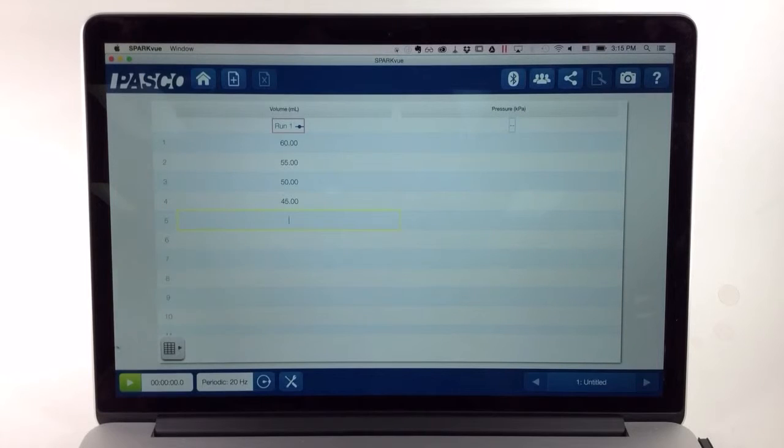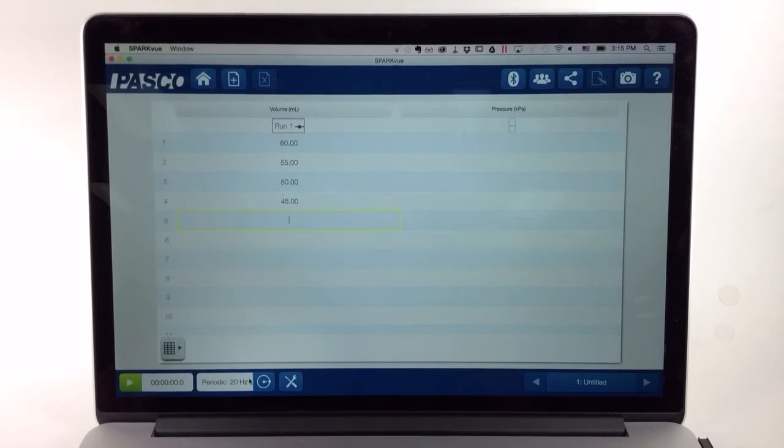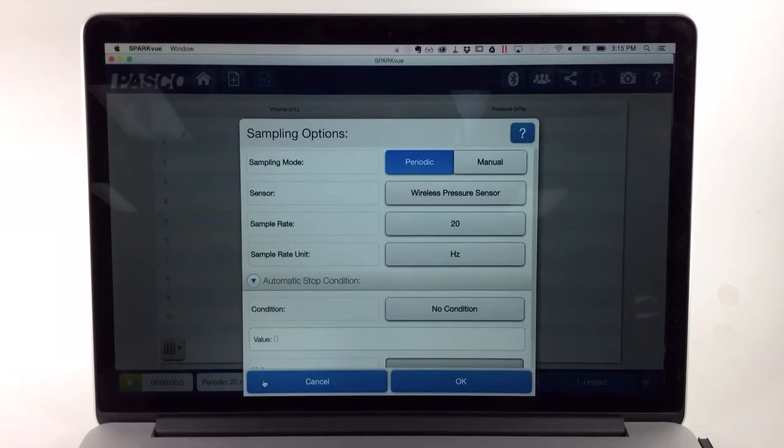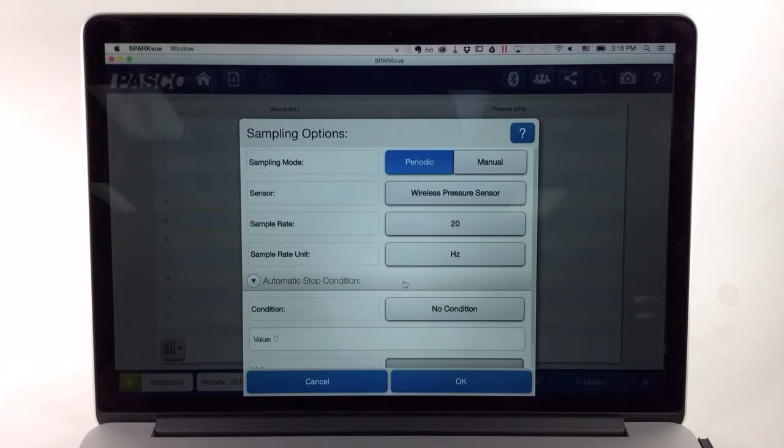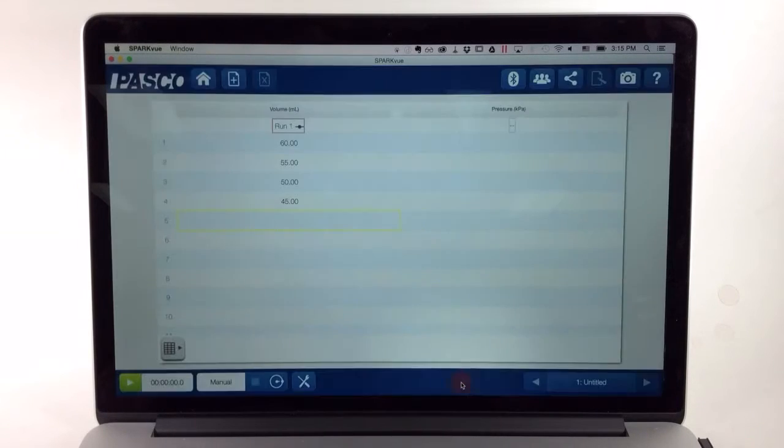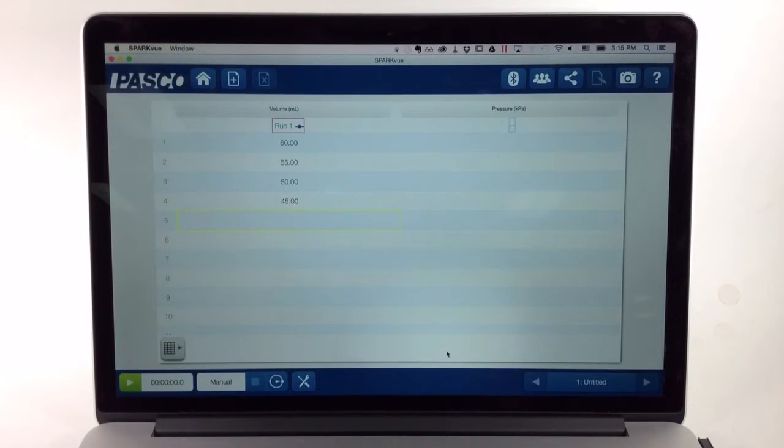Before I record data, it's important that I switch from the default sampling mode of periodic sampling, in which case I get 20 samples every second, to the manual sampling mode. I'll open up the sampling options, switch to manual, and press OK. Now measurements will be recorded only when I command them to.